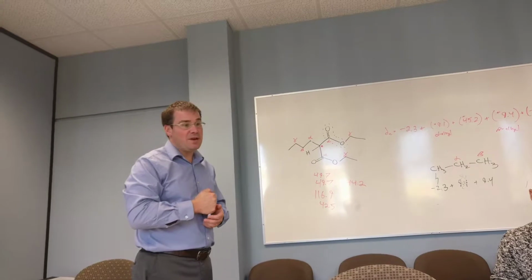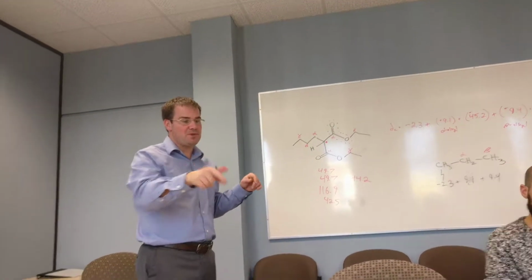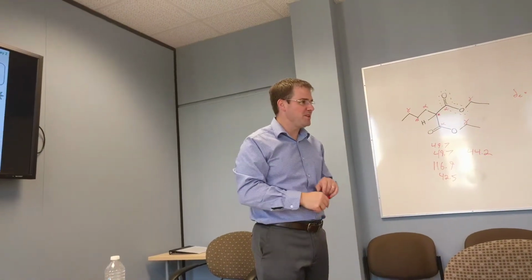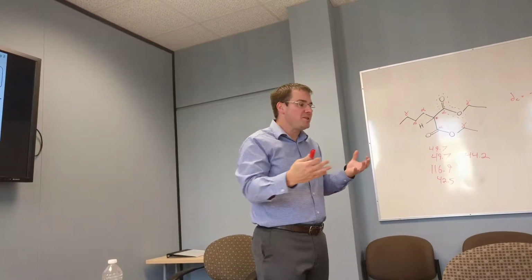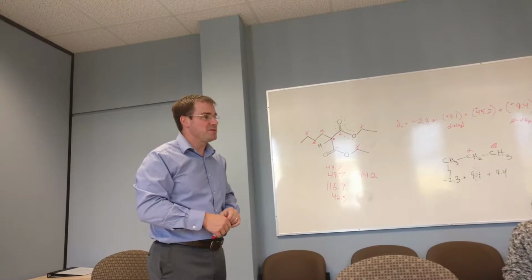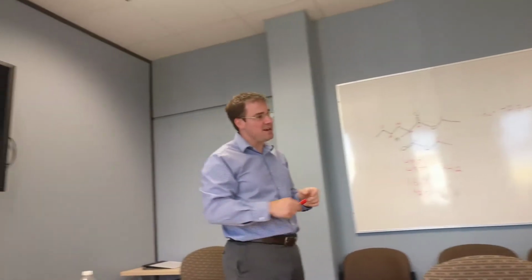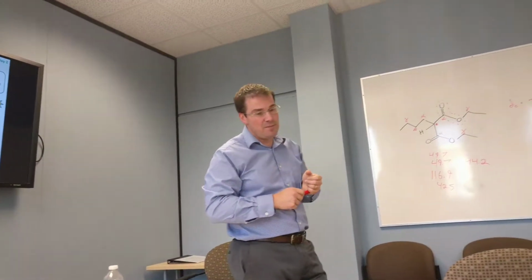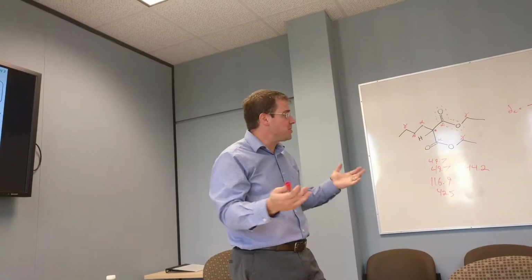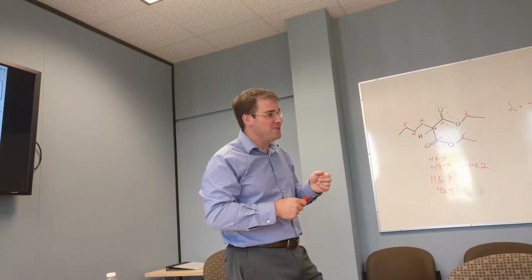I'll show you when we get together next time. I've given you some calculations to do, and I'll show you the ChemDraw output for those calculations as well. You'll see that it's not particularly accurate, but it's not more or less accurate than doing it this way. In fact, it's using a very, very similar additivity table. It's not exactly the same as the additivity table that you have here, but it's similar. And that's basically what it's doing. And it's a fast process, because even though this is tedious for you to do, it's very fast for even a very low budget computer to do.